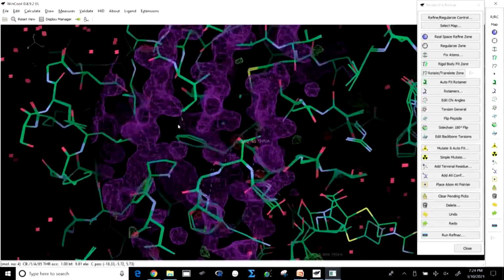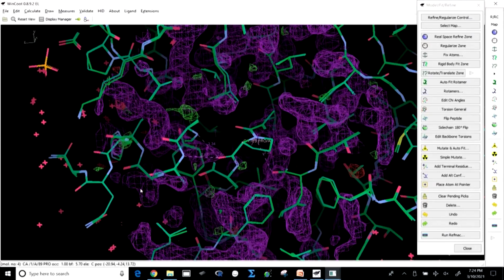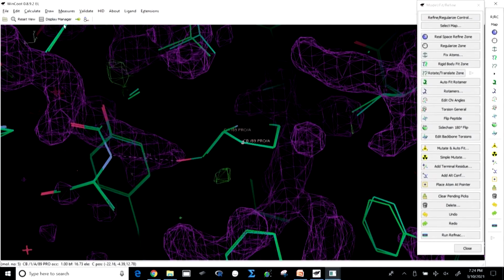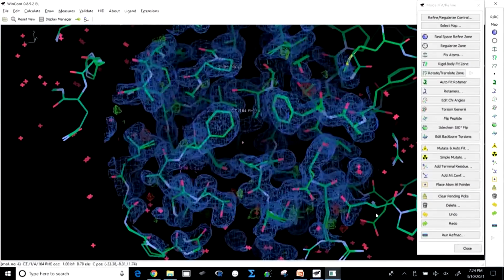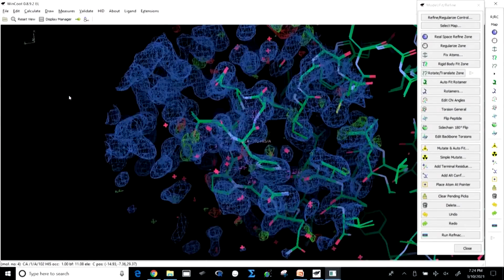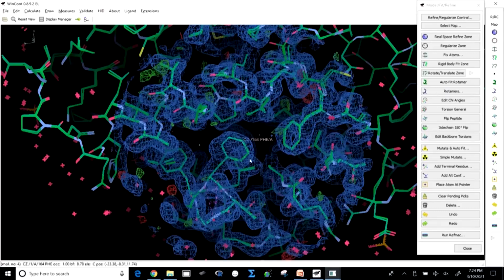You see, as I was talking about, now you cannot align them because the PDB file actually moved. So you could only see them with respect to the initial map, because they have aligned based on that structure. So you can move the PDB file, you cannot move the MTZ file.